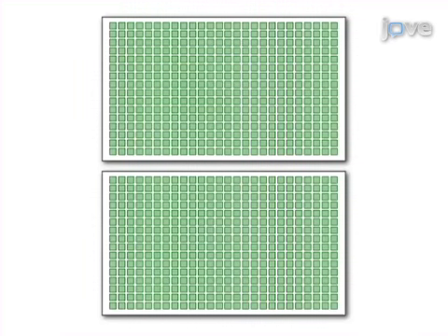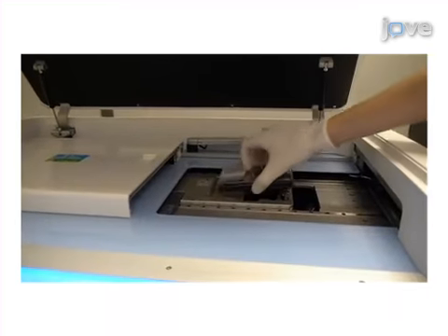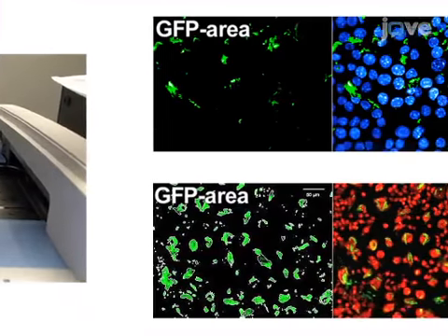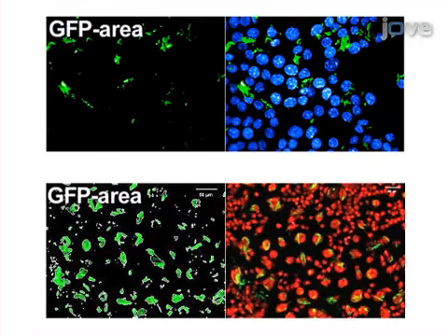After staining the cells, the final step is to read the plates using an automated confocal microscope. Ultimately, automated fluorescence microscopy, followed by image-based analysis, is used to measure the changes in GFP-MTB intracellular growth.